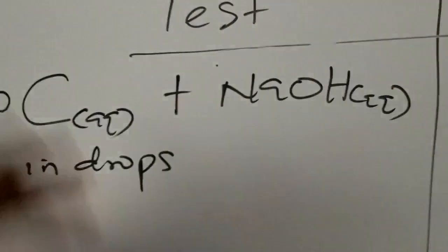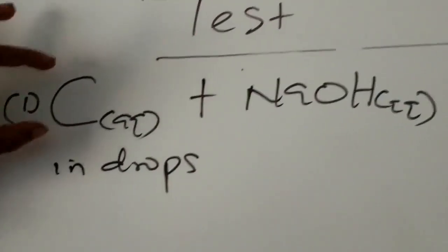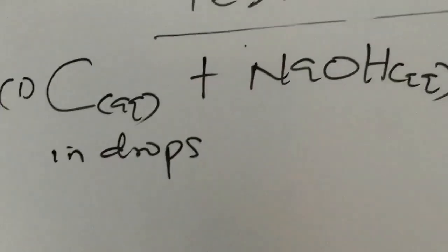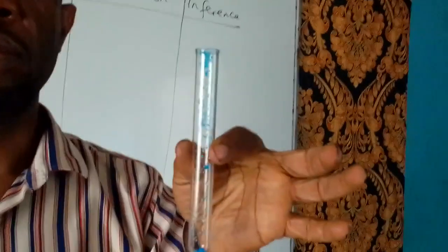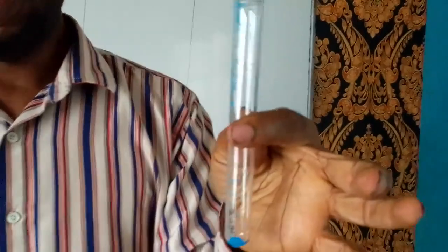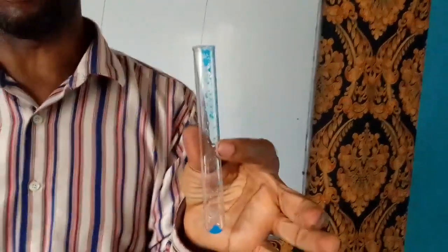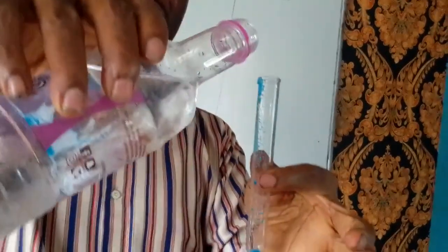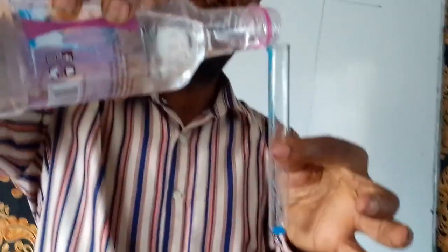So we're going to go to the experiment and take an unknown salt sample, and then carry out our experiment. Let this be the unknown substance which we call C. And as I told you in chemistry, this is solid. You don't do chemical tests with solids. So what I have to do is add water to this C to dissolve it.